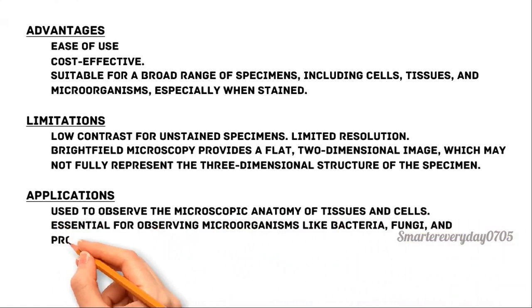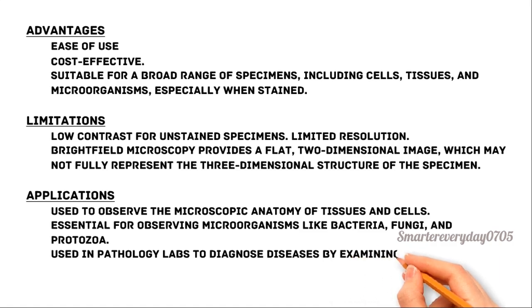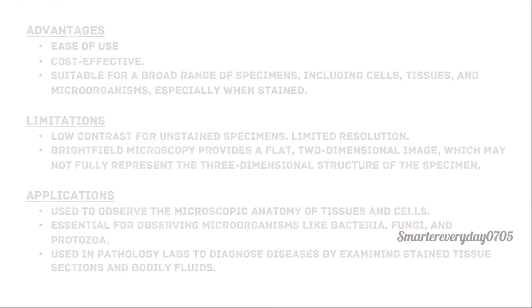Essential for observing microorganisms like bacteria, fungi, and protozoa. Used in pathology labs to diagnose diseases by examining stained tissue sections and bodily fluids.